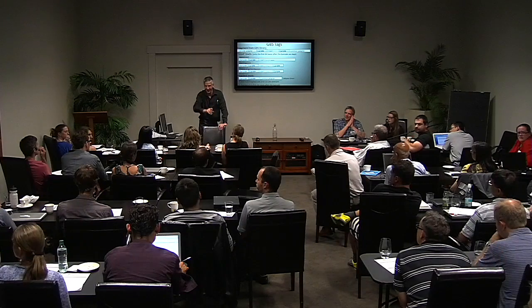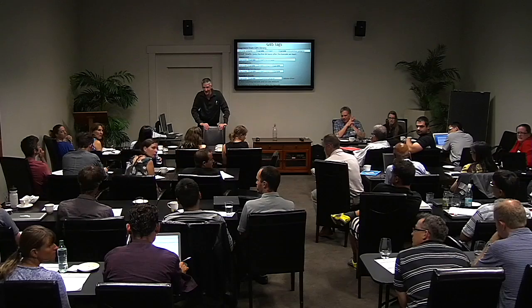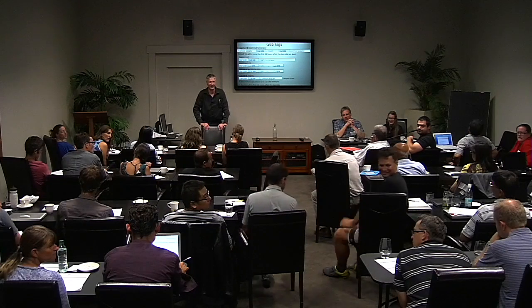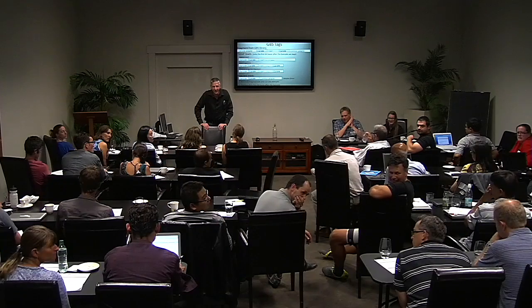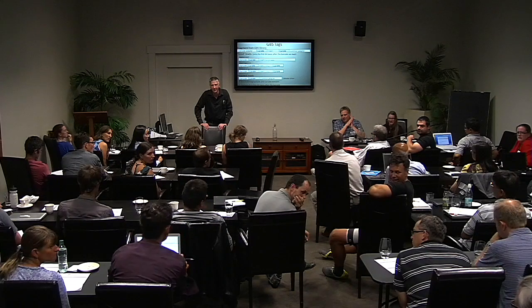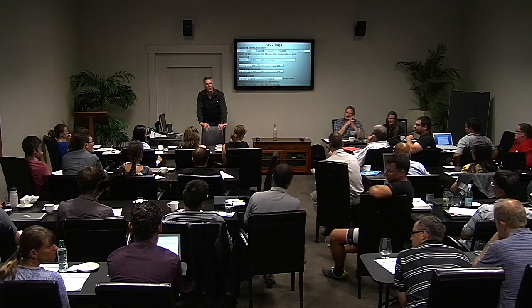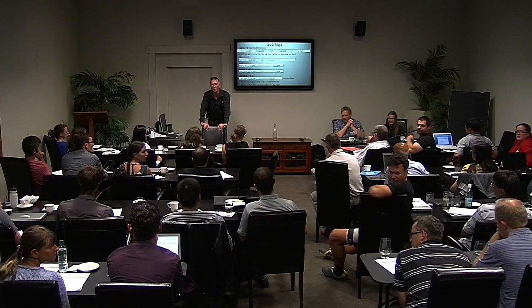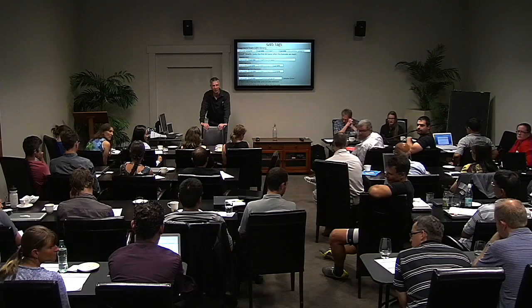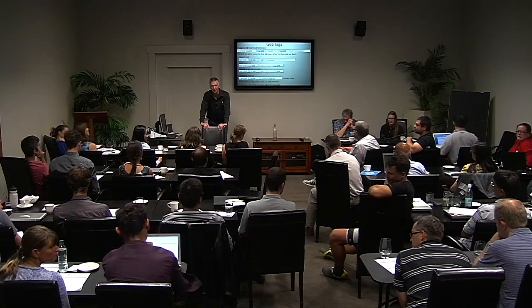That's way more than, speaking because we've sequenced the genome back when next generation sequencing was pretty crap, and we were looking at a lot around 20, 30, 40 reads. If you have one mismatch in 20 or 30 base pairs, you won't actually be able to map it accurately onto the genome in the first place. So it would fail at the alignment step. For mammalian type genomes, with diversity and everything else, you really need 50 or 60 bases minimum to do a good job with the alignments.